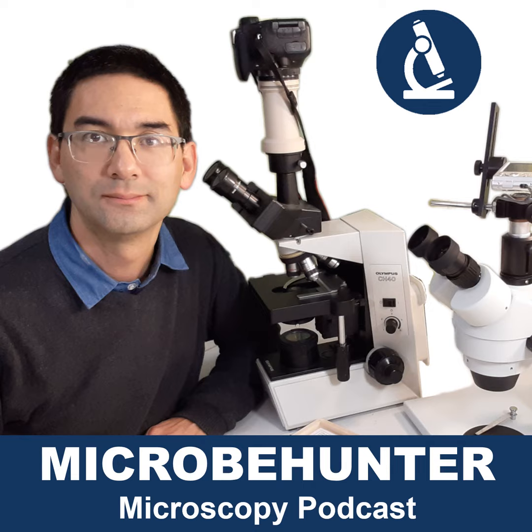There's not a lot of overhead that you need to take care of before you can actually start doing the hobby. Theoretically, you can take it along. So you go on a holiday trip somewhere and you have your own little travel microscope. That's a possibility. So especially if you're interested in natural observation and you're visiting a new place, for the summer holidays, I'm going to go to the beach. So it would be kind of nice to have a small microscope there to, let's say, observe the water life in the ocean a little bit.